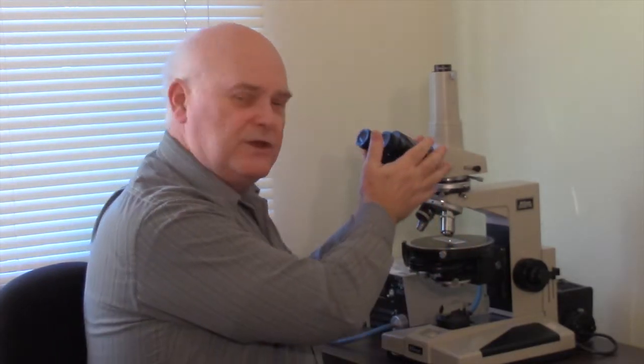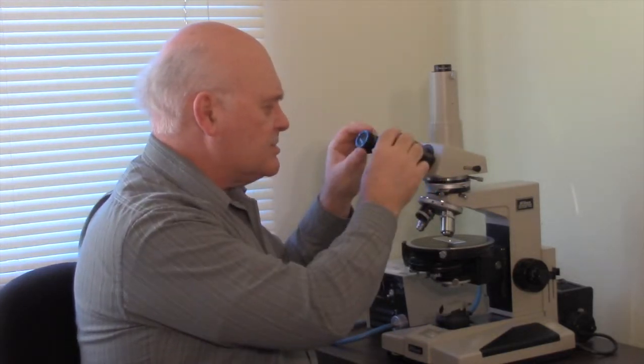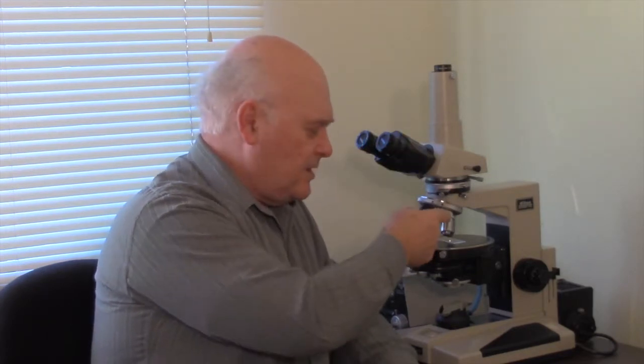And then it comes up into the head, and in the head of the microscope, we come up into the oculars. The oculars are 10 times magnifiers, so we end up with a magnification of 10 times here, 40 times here, there's our 400. And then depending upon your particular microscope, the intermediate tube may add another additional magnification step.